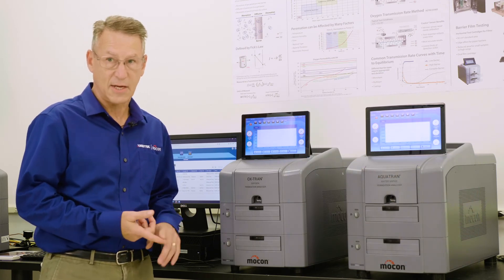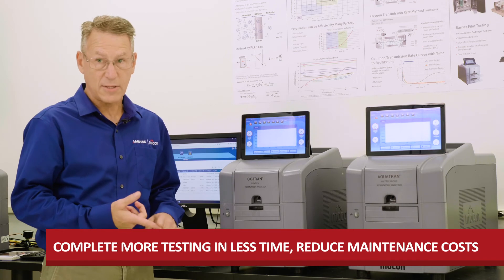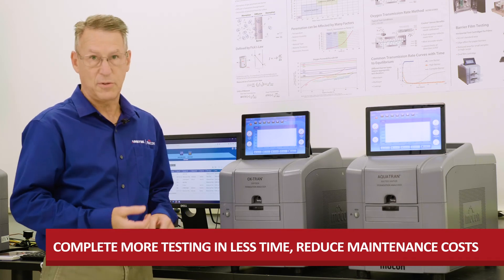Compared to many existing instruments, both of these models can complete more testing in less time and they help reduce maintenance costs.